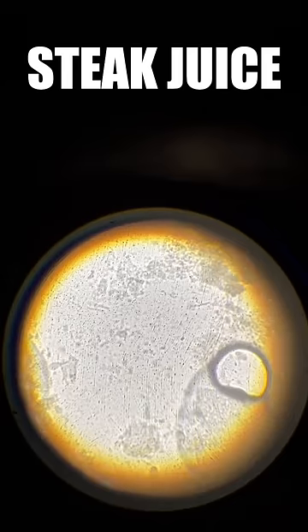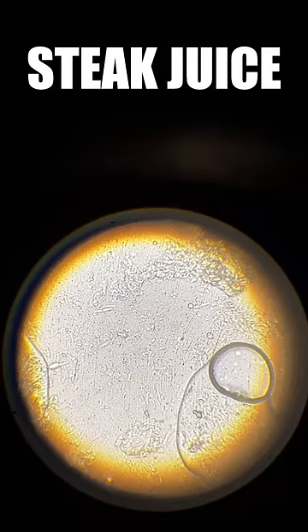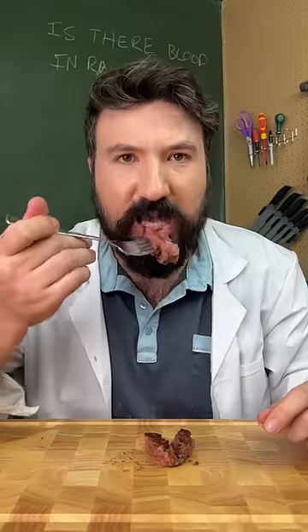Moving on to our steak juice, what you'll notice straight away is it looks completely different. Essentially what this is is 75% water and 25% what's called myoglobin, which is found in the muscles. So you can see it definitely wouldn't be considered blood. In fact, if butchered properly, you'll find no blood in your steak at all.